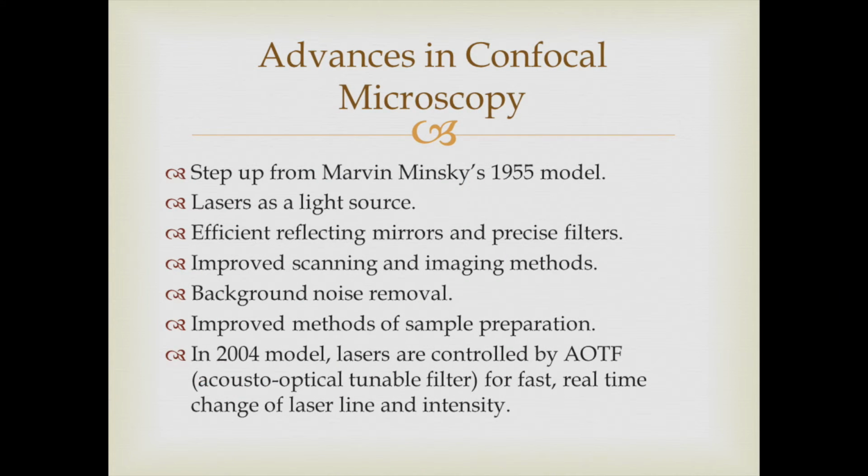Considering the time duration that has passed between Marvin Minsky's original 1955 confocal microscope and today, there have been multiple advancements in confocal microscopy since then. Light sources have been replaced from visible light to lasers. The reflecting mirrors and filters inside the microscopes have become more precise. The scanning and imaging methods have been improved. Background signal removal has become more precise because, as I mentioned before in this video, contaminants can also take up fluorophores and would interfere with our study of the specimen in question.